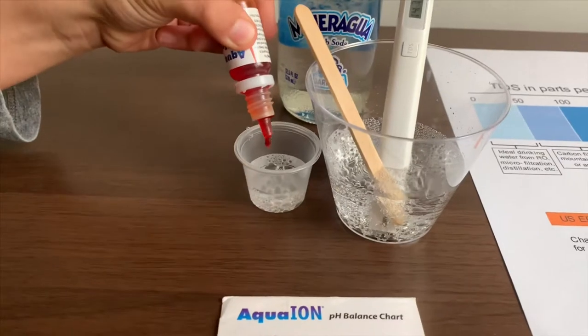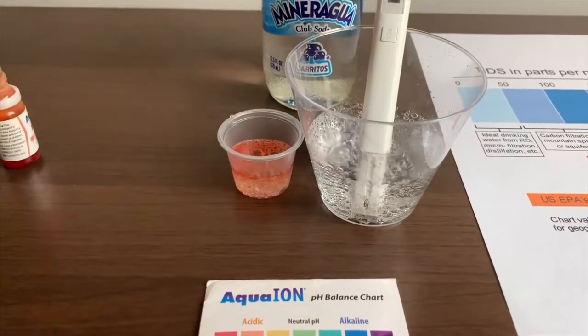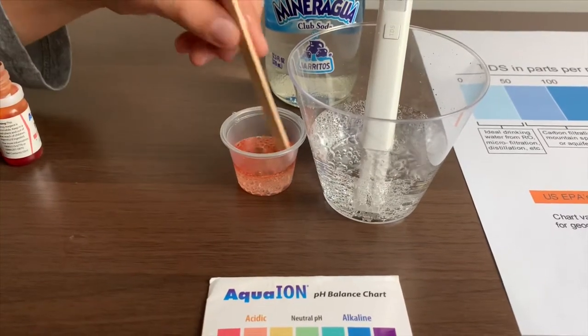I'm going to do two drops. Let's also stir this with the other side so we'll get a better result.